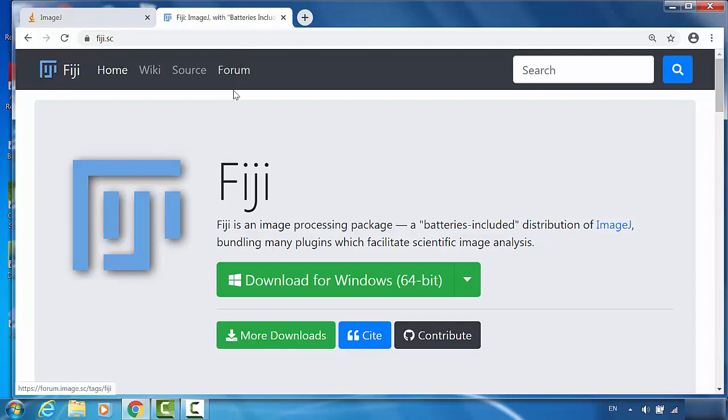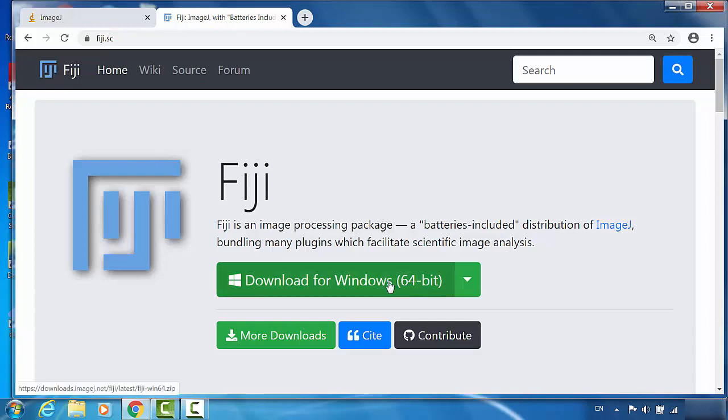Fiji actually stands for Fiji is just ImageJ. You can choose different platforms, but I'm a PC guy, so we will go through Windows. I just click download.